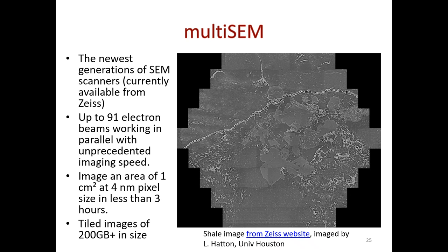So how do I unify these scales that we see across all of the images? That's part of the grayscale image processing that we're going to get to. However, it's quite amazing what we can do. You can actually get to millimeter scales with nanometer resolution. Here is an example of a 1 centimeter scale at 4 nanometer resolution. That's what's currently possible. So, okay, this is what we need to actually capture heterogeneity.